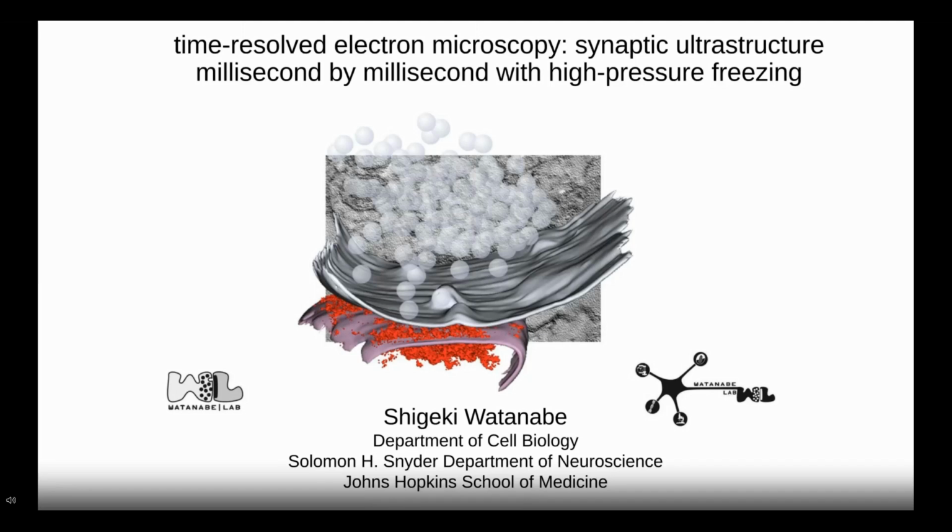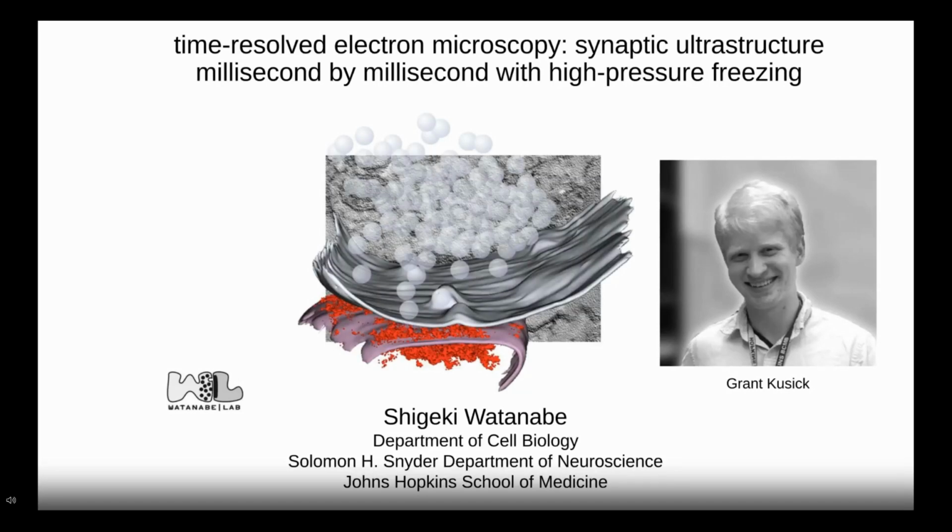Okay, so thank you so much for such a nice introduction, and thank you all for tuning in today. I'm Shigeki Watanabe, and I'm an associate professor in the Department of Cell Biology at Johns Hopkins. And today, with my graduate student, Grant Kusick, we are going to talk about high pressure freezing and how we are using this technique to look at membrane dynamics at the synapses using electron microscopy.